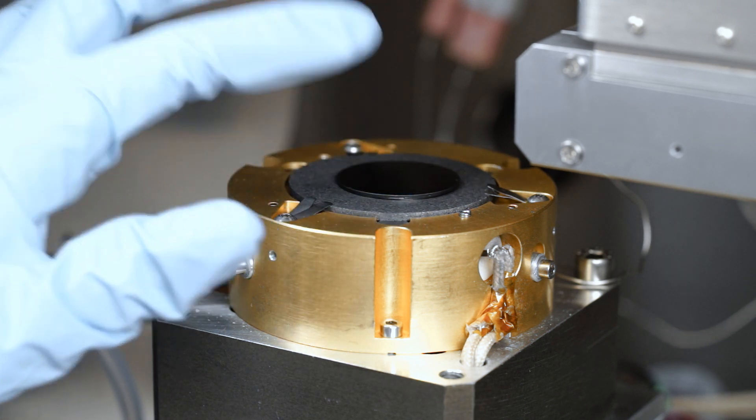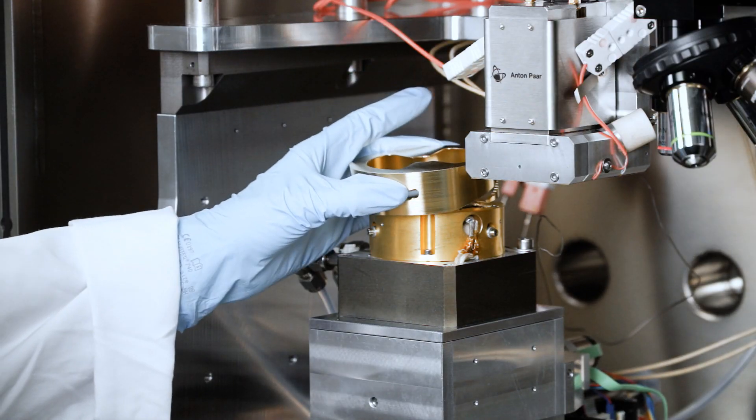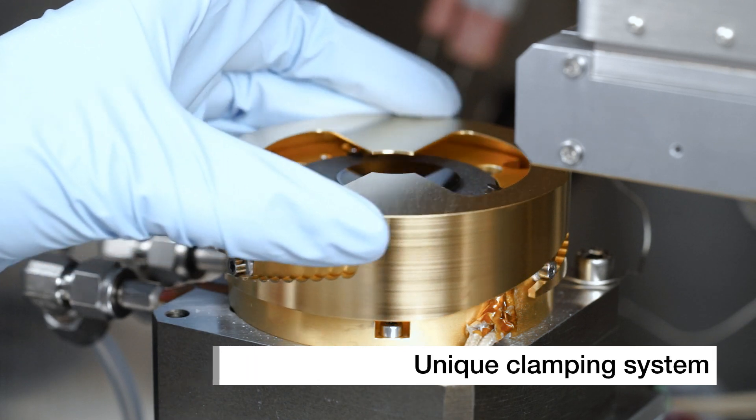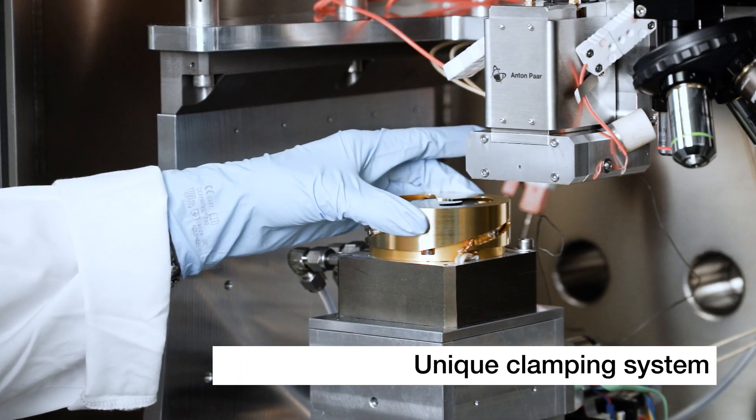A novel clamping system allows you to rigidly hold the sample over the entire temperature range and makes it easy to change the sample.